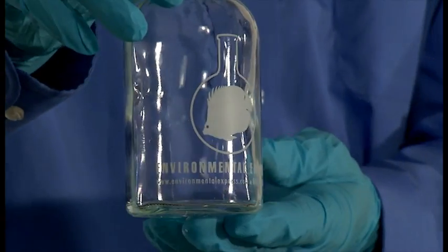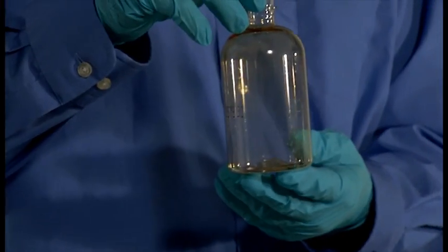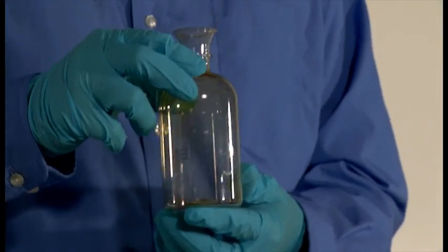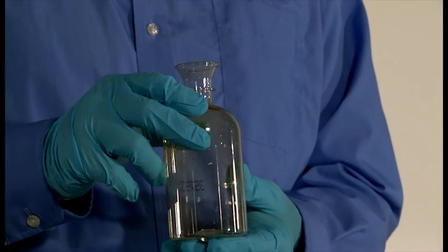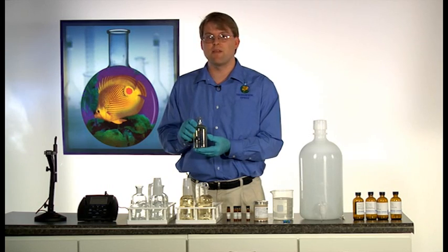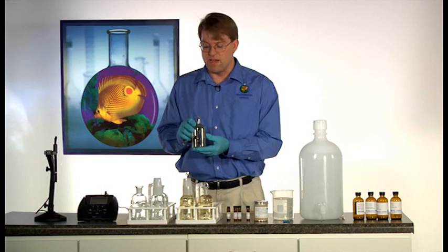Traditional glass bottles or plastic bottles are available for use. These plastic bottles are specially designed and approved by the EPA for use in the determination of biochemical oxygen demand and dissolved oxygen.